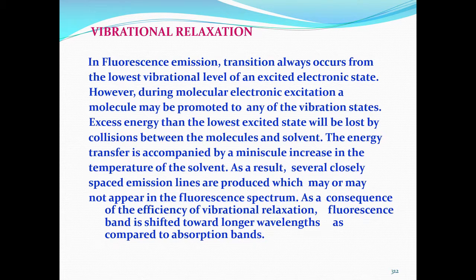My next slide will show you that in fluorescence emission, transition always occurs from the lowest vibrational energy level of the excited electronic state. However, during molecular electronic transition excitation, a molecule may be promoted to any of the vibrational states. So, excess energy above the lowest excited energy level will be lost by collisions between the excited molecules and the solvent.